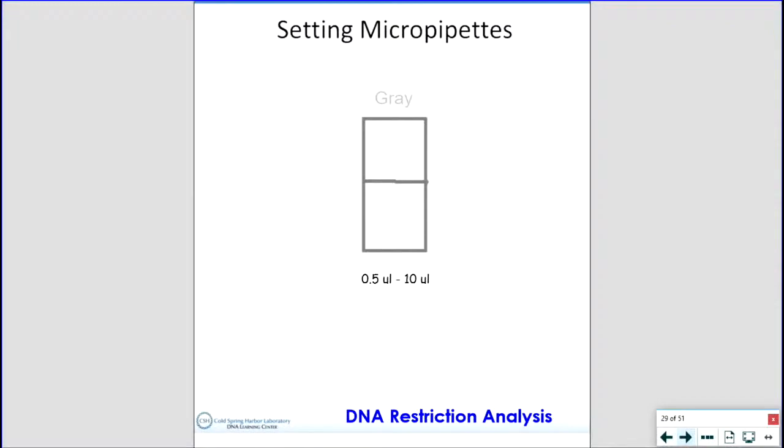That prefix micro is pretty important. Up on the PowerPoint here, it's like a U, but it's really written as a fancy U, kind of like this. It's called a mu. And that prefix micro is basically telling you that a microliter is a millionth the size of a regular liter. So it's 10 to the negative 6 liters. 1 microliter is a millionth the size of a liter.